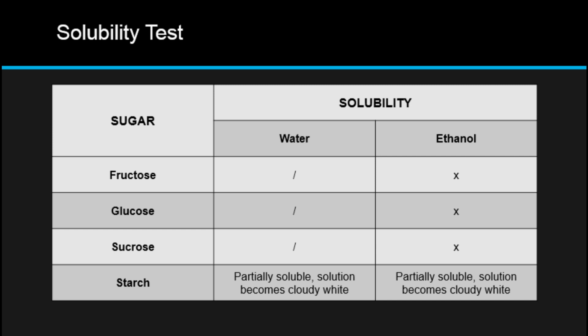This can be called gelatinization. The granules swell and fragment under heat treatment. Insolubility in ethyl alcohol is explained by water having more affinity to the alcohol than the starch. So this lowers the solubility and the potential hydrogen bonds.